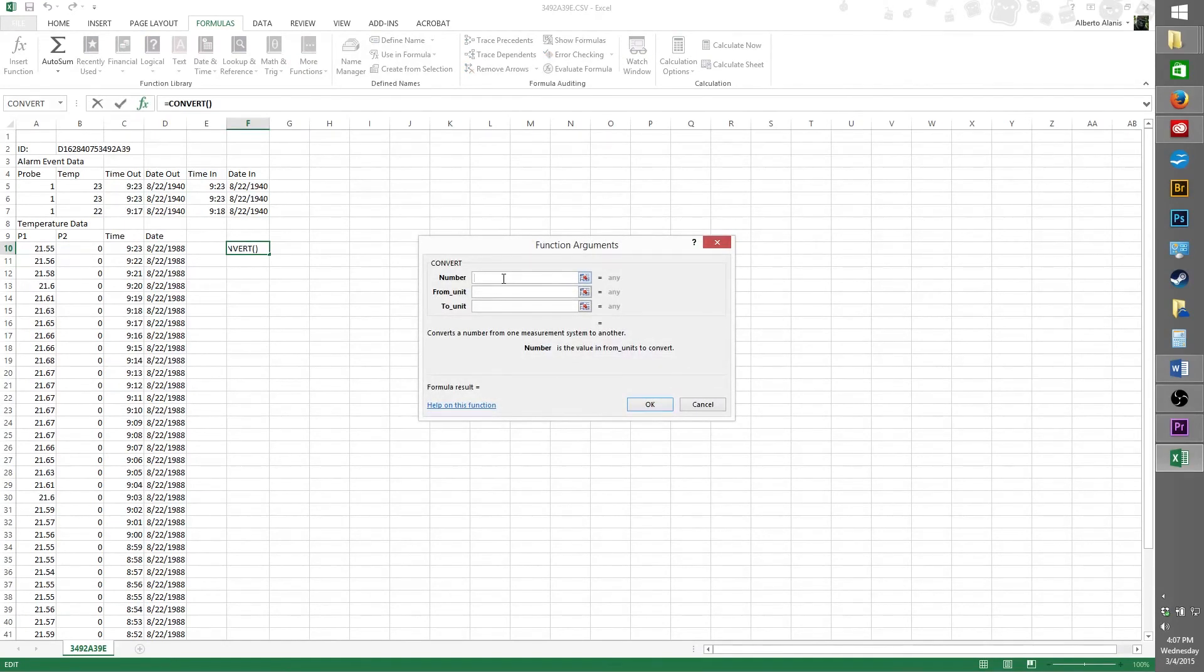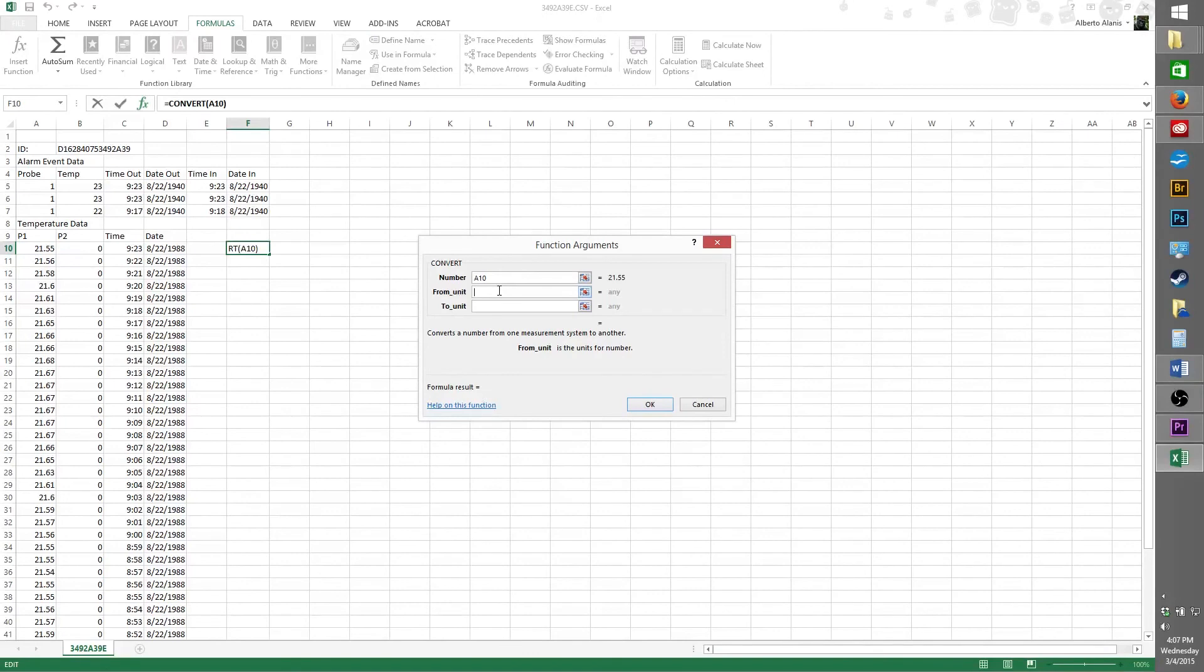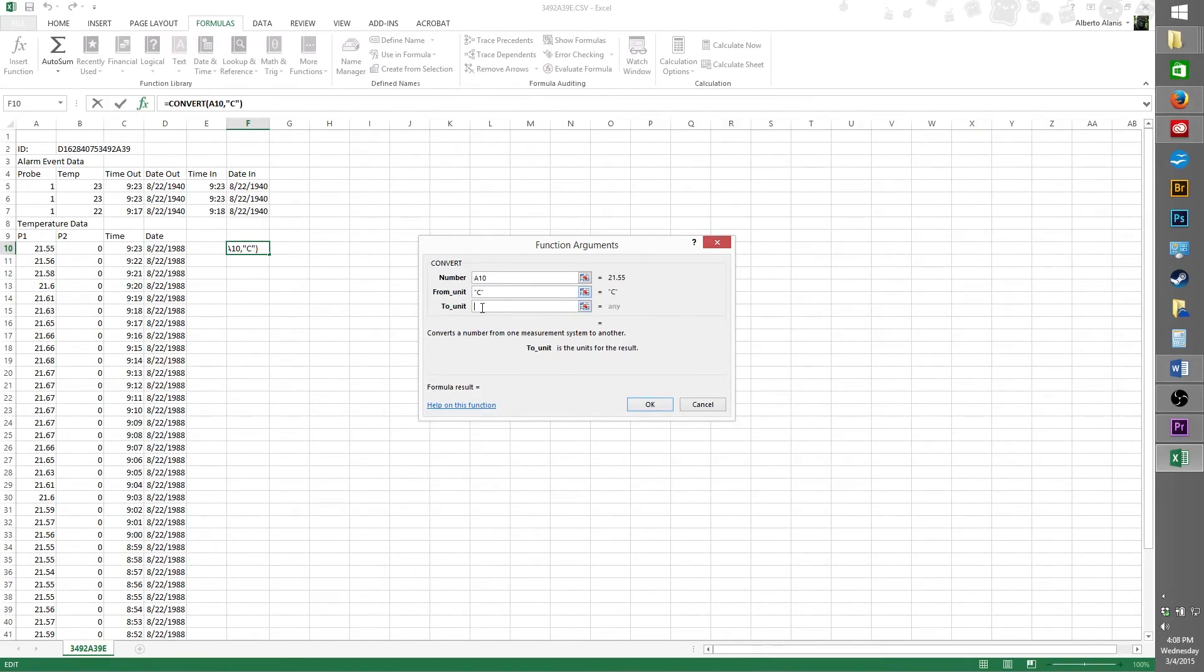Click on the empty box on the right of number, and then go to your spreadsheet and click the same Celsius reading on that row. Next, click on the empty box to the right of from unit. In this box, you're telling Excel what the current temperature format is. Type in a quotation mark, the letter C, and then another quotation mark. And then on the box below that, quotation marks, F, quotation mark. Once you're done, click OK.